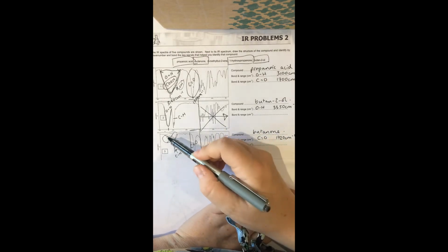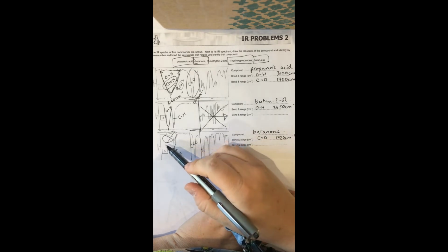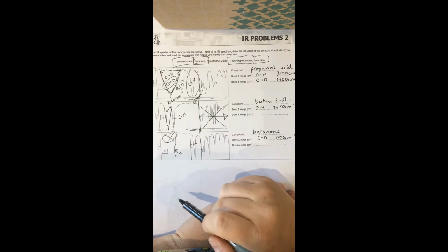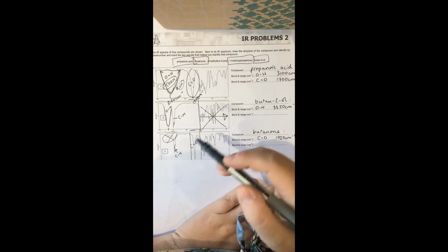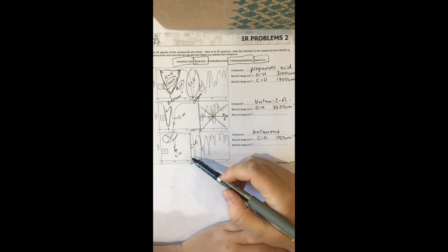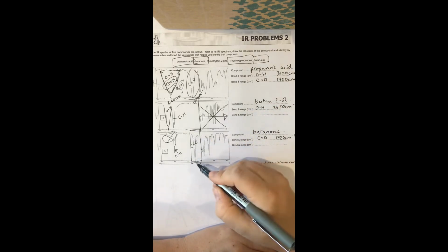So number 3, you can see there's no OH peak there. So we're not looking for a carboxylic acid or an alcohol. This peak here is your CH peak. So that's not very interesting. But what is interesting is this strong, sharp peak here, which at around 1720 wave numbers is clearly a carbonyl peak, C double bond O. So that means the molecule we're looking for is butanone. So the only one that's got a carbonyl peak, but nothing else.